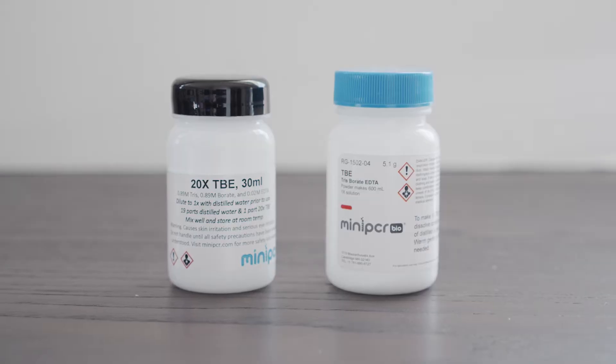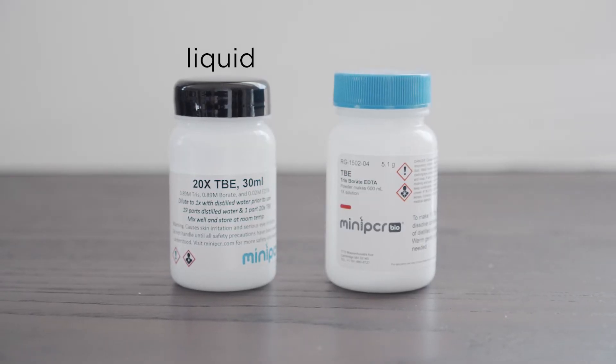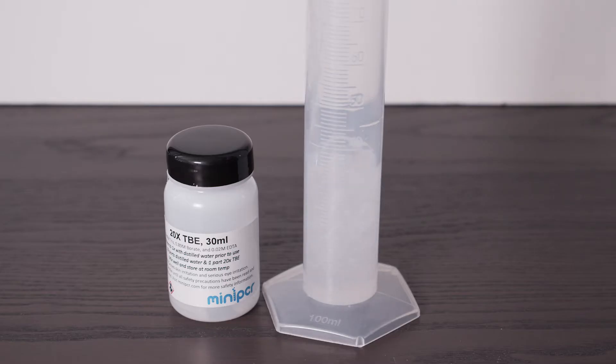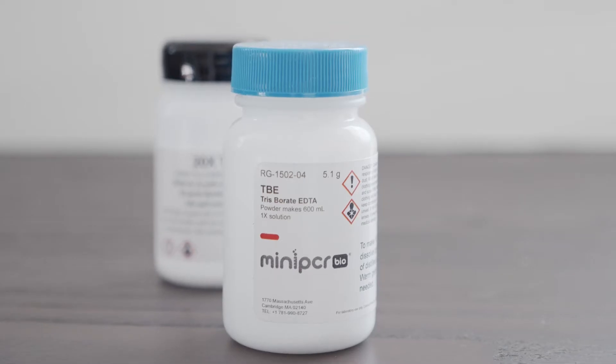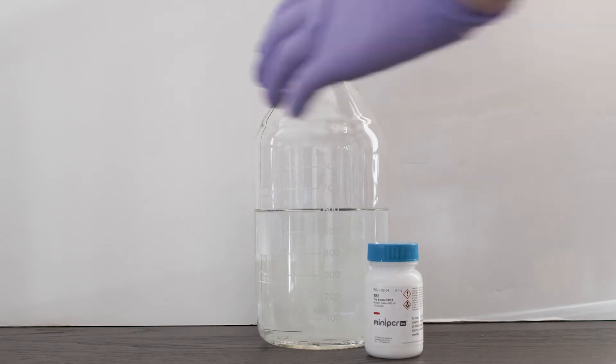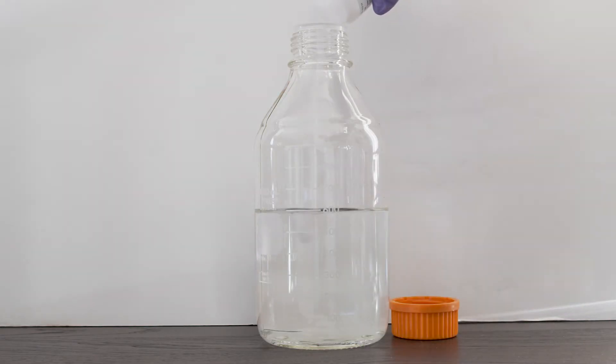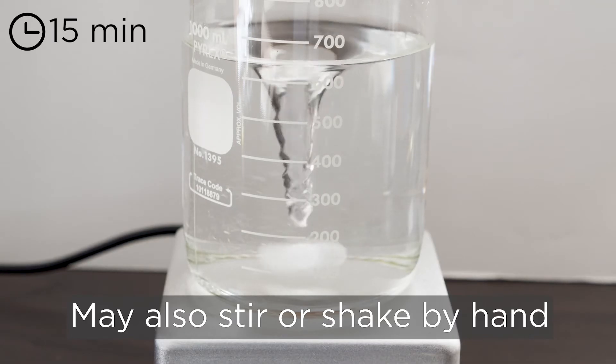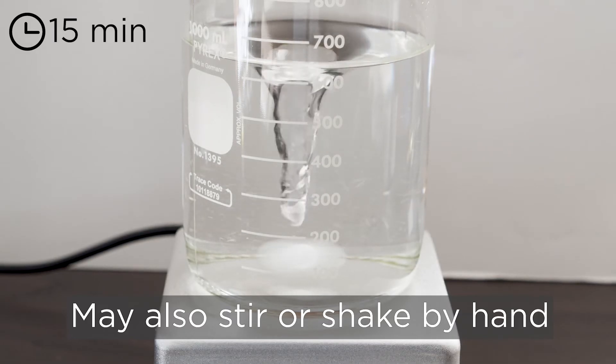Next, you'll want to assure that you have the appropriate quantity of 1x TBE to both cast and run your gel. TBE is usually provided as a liquid concentrate or a powder. If using liquid TBE concentrate, follow the instructions to dilute it with an appropriate volume of distilled water to make 1x TBE. If using TBE powder from Mini-PCR Bio, add the powder contents of one 5.1 gram container to 600 milliliters of distilled water. Mix well. Gently heating the solution can help to speed up dilution. Note that it can take up to 15 minutes for TBE powder to dissolve, so plan ahead accordingly.